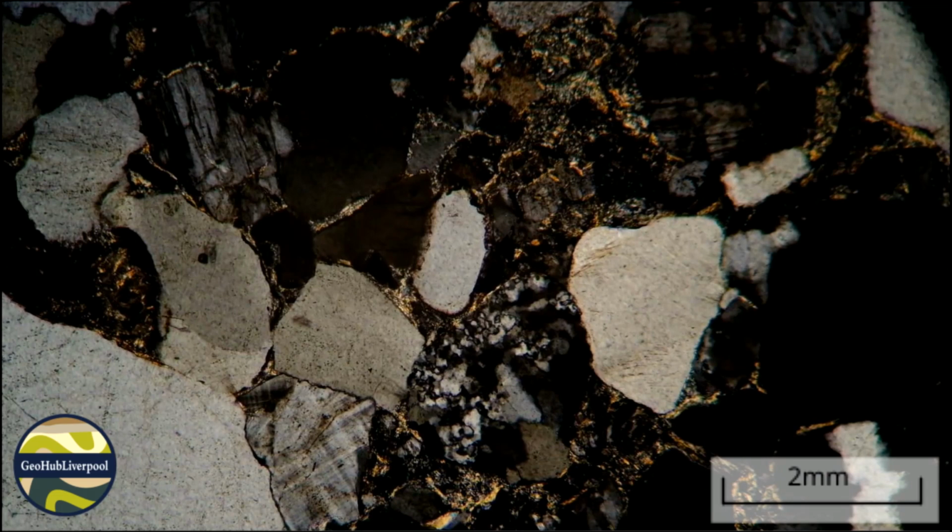Most of the grains are between 0.5 mm and 2 mm in size and are moderately to poorly sorted, which means that they show a range of different grain sizes. The sub-rounded to subangular grains are touching, so the rock has a grain-supported fabric. There is no preferred orientation of the grains.